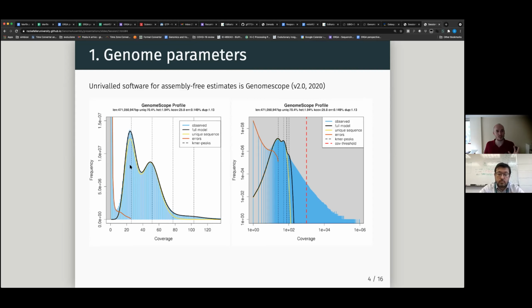quite a lot. So basically, this is how you look into this plot. Then I will ask you if you have a question, but there is another important consideration here. There is a lot of stuff that, as we can see, is very high frequency but very low coverage.